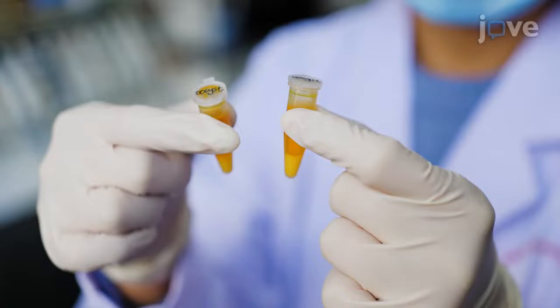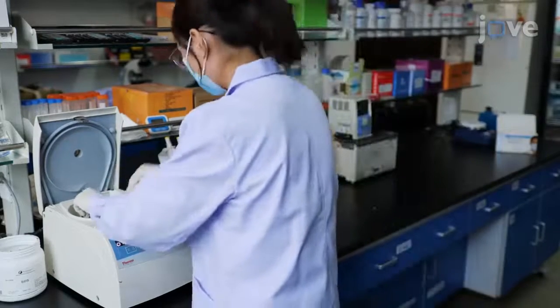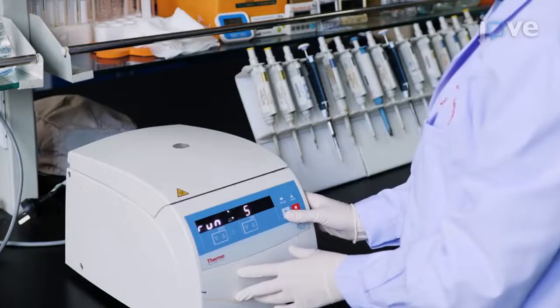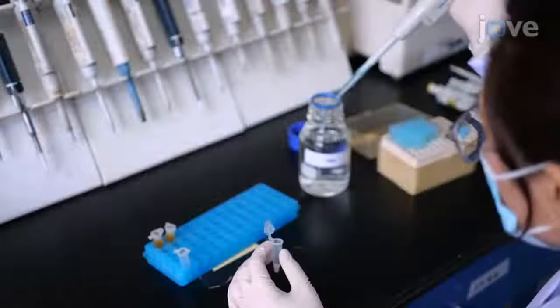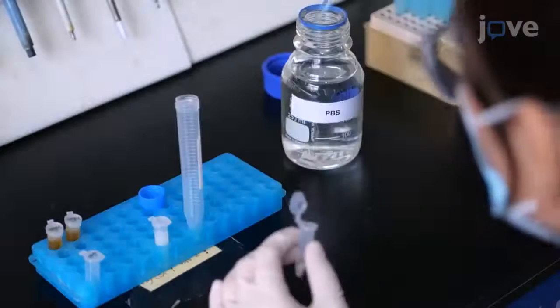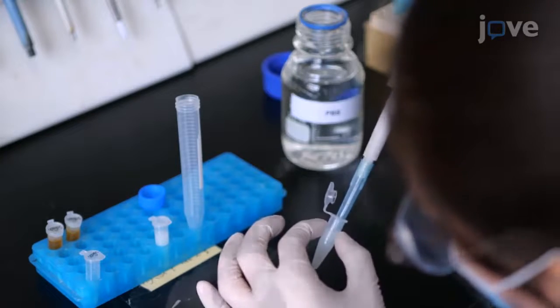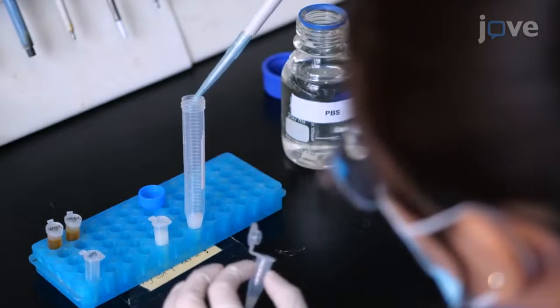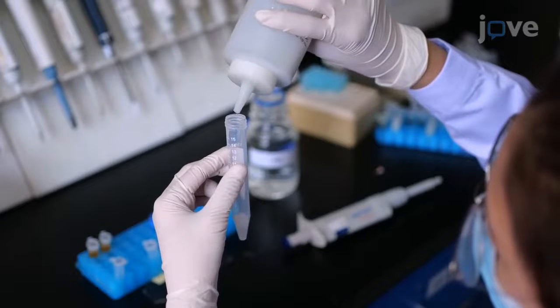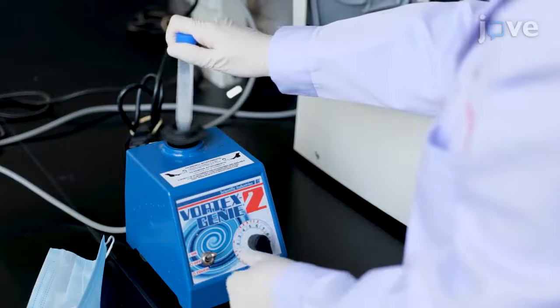To start with release of sporocysts, centrifuge one times ten to the seventh sporulated oocysts in potassium dichromate solution at 2300 times G for five minutes. Wash them with PBS three times. Resuspend the pellet with one milliliter of PBS and transfer the mixture to a 15 milliliter tube. Add an equal volume of one millimeter diameter glass beads and oscillate the oocyst suspension using a vortex mixer to release the sporocysts.